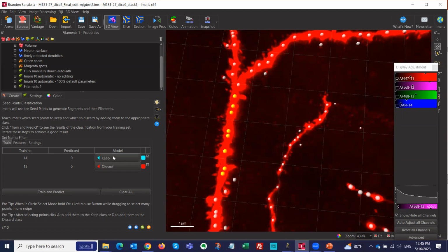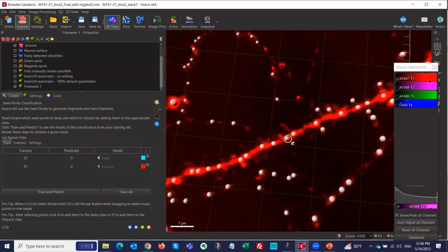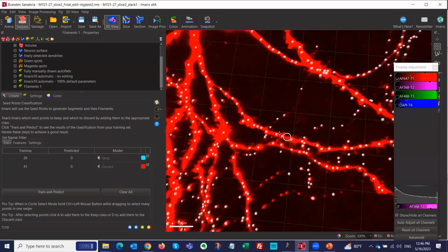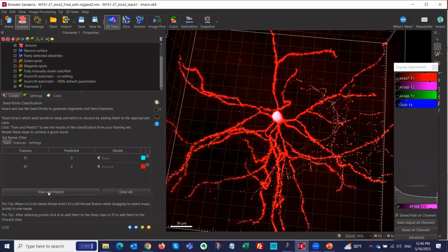You obviously don't do all of them, as I mentioned. Just do a few. This one keep. And again, as I mentioned, I don't want those. It's just to show you. I want to remove them. It's a nice way to show you how the machine learning works, because we want to discard those guys here. Discard, and then we want to keep them. Keep, and we want to keep a few more here. These guys keep. Now that I have like 31 and 41, I just click train and predict, and it will label all of them for me.